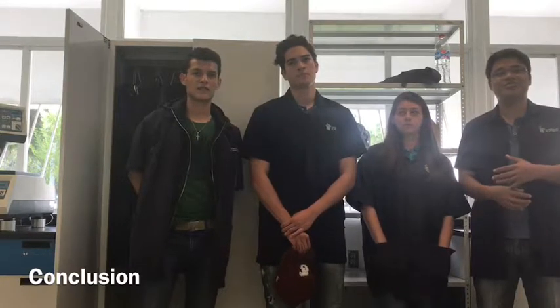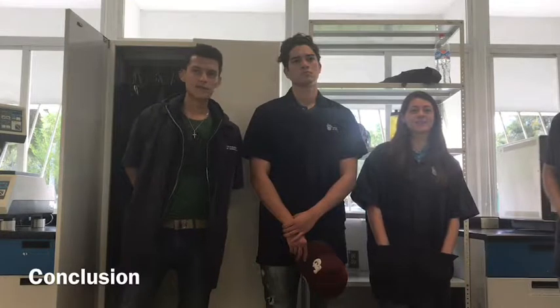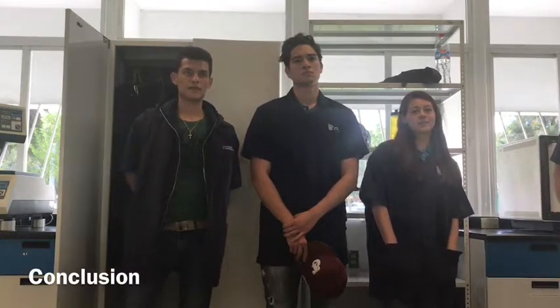In this practice, I learned how to get samples to analyze the grains and the components of different materials. This is very important in the industry because you can understand how the material is going to behave when you are using it. In this practice, I learned how to use different machines in the lab, such as the cutter, the mounting press, and the sanding machine. And I think it is important to know the properties.